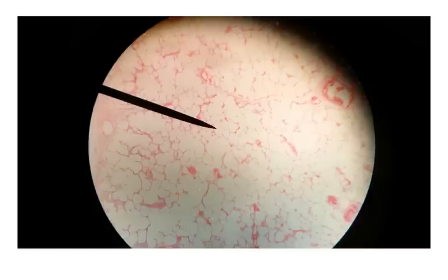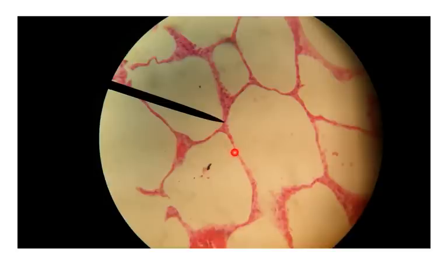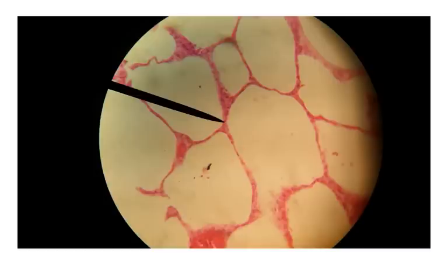Let's zoom in on this same slide to identify the structures. Now at higher magnification, these large open spaces are those alveoli. You'll need to know the different cell types here. We see very long, flat cells — think back to Biology 137: a single layer of very flat cells is called simple squamous epithelium. This cell type allows for efficient diffusion and is also called type 1 cells.